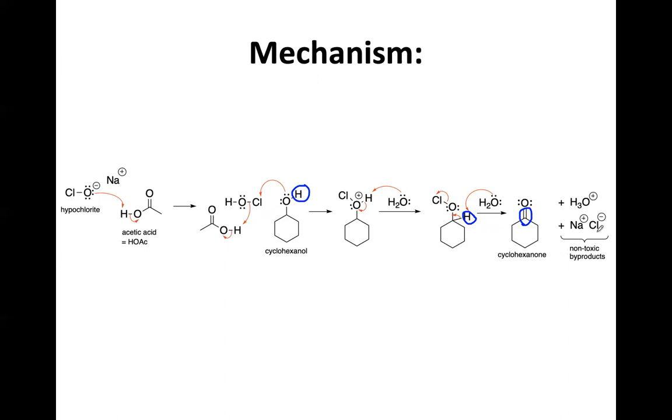As you may recall from lecture, some of the other oxidizing reagents, for example, the Jones oxidizing reagent, which is chromium trioxide, is super toxic. In fact, it's carcinogenic. So at this stage in your organic chemistry career, we don't want to have you work with some super toxic and dangerous things. So this is a very safe way for you to experience an oxidation reaction.